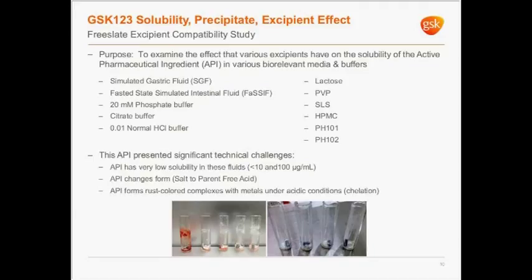There's a lot of information on this slide, so let's go through it. A Freeslate CM3 was used to perform the studies that are described in the rest of this presentation. At GSK, we purchased a core module 3, also known as a CM3, in 2014 for our King of Prussia site in Pennsylvania. In the time since, we now have a collection of 3 CM3 machines as well as a protege unit for solid dispensing.